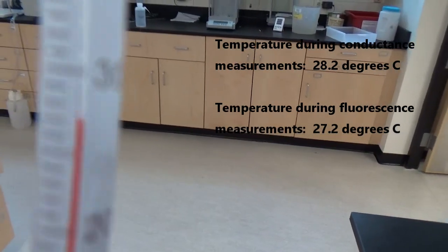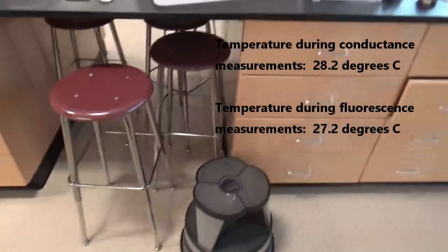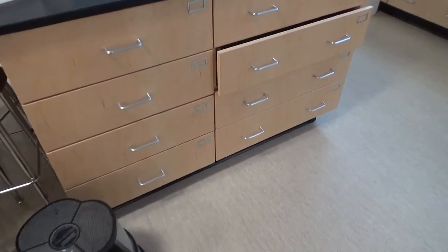Well, it hasn't gone down that much. It's about 27.2. Before it was 28.2. So that means that the temperature when the critical micelle concentration was measured was 28.2, but with the fluorescence measurements it was about 27.2.